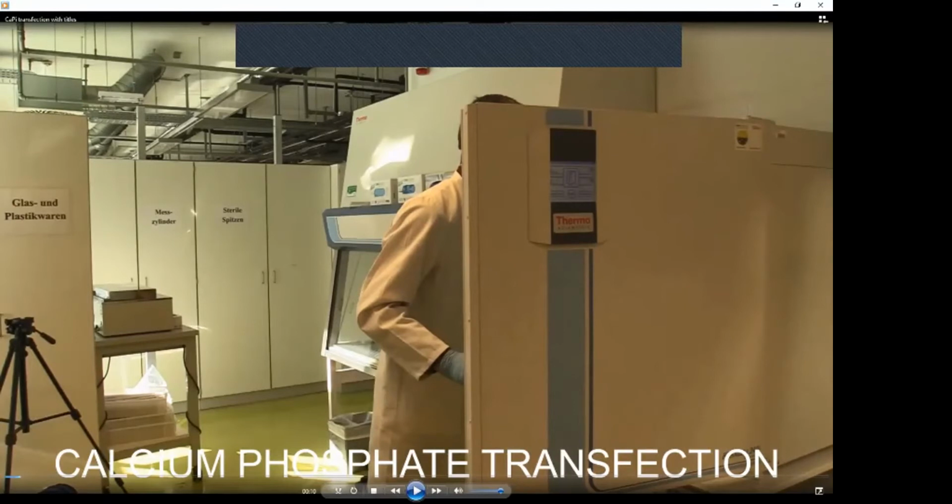For these MEFs, we have tested it before, and this was this number 150,000. Then cells were seeded in the full medium, which contains both FCS and also Pen-Strep, which is the penicillin streptomycin antibiotics. And they were incubated overnight at 37 degrees.